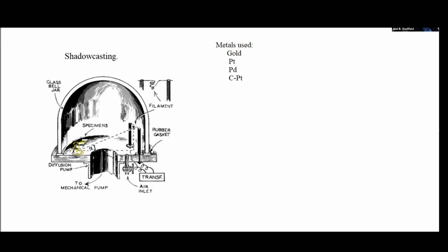And at some distance away, you have a pair of electrodes in the vacuum system. In the one that's drawn here, it's actually drawn as if it has a basket in it. So what you'll see here is a wire and then a kind of a coil. And then the wire continues. So this coil is referred to as a basket.